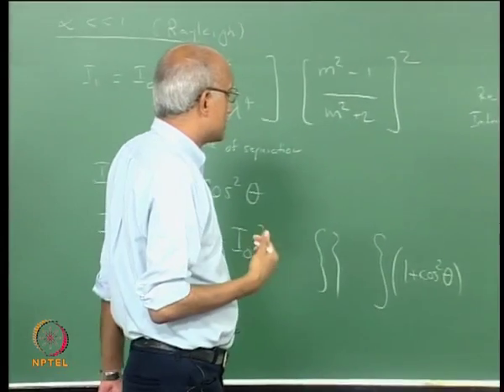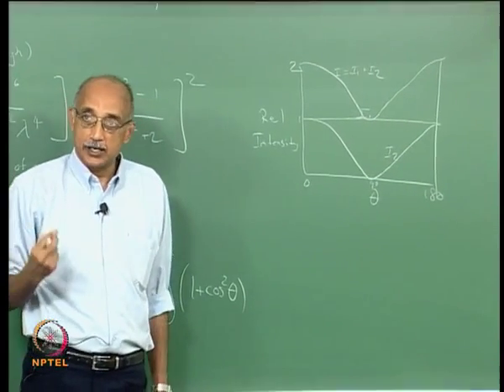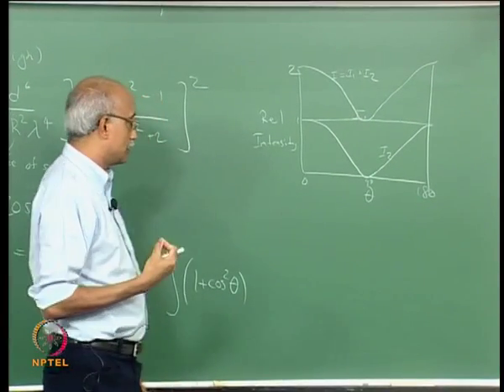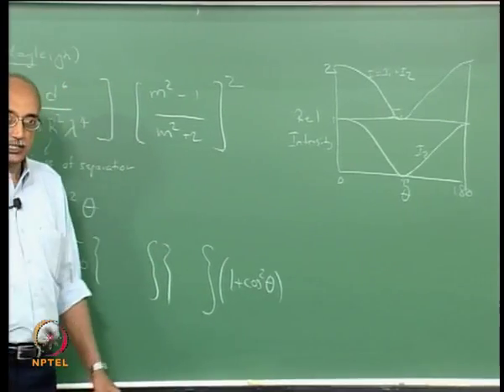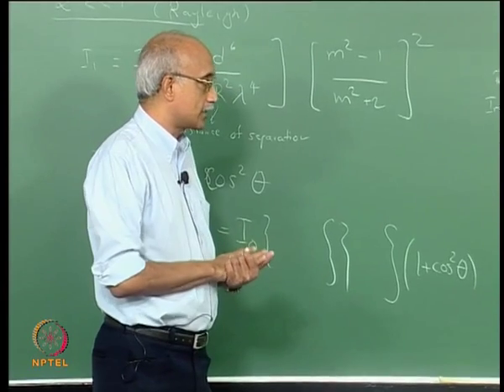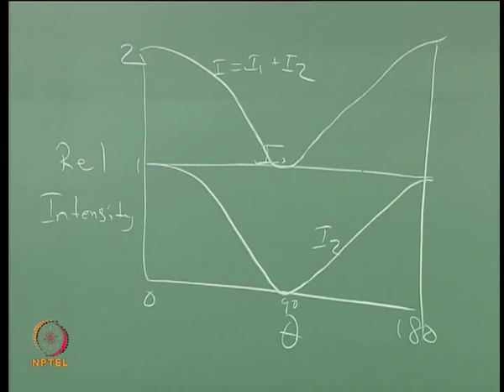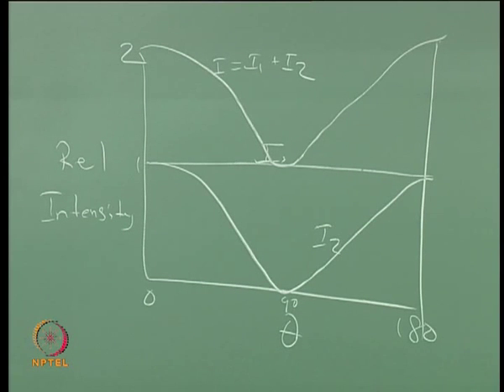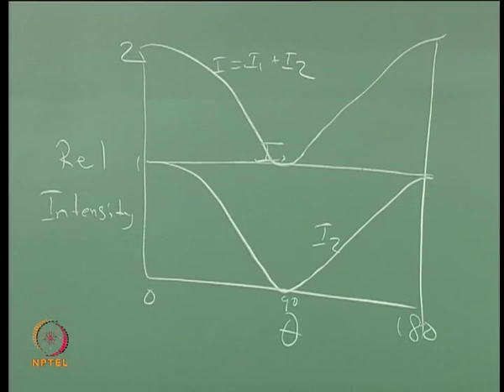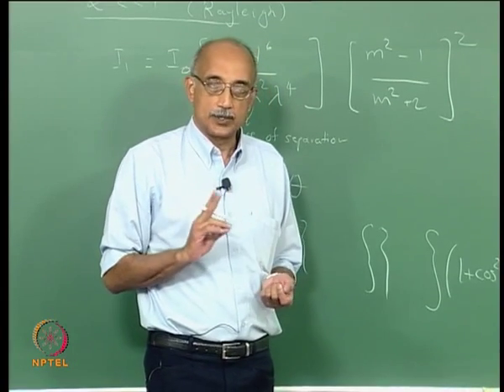So if you are trying to measure scattered light intensity from a spherical particle that is in the Rayleigh scattering regime, you can see that the dependencies are very well established. The expected relationship between scattering angle theta and the scattering intensity is also well established, predicted, and it can be measured and validated as well. So particle size measurement in the Rayleigh regime is actually the easiest to accomplish.